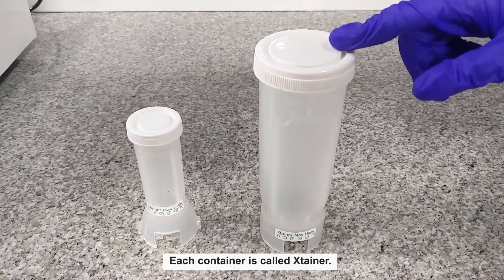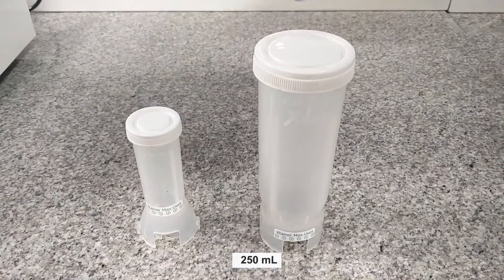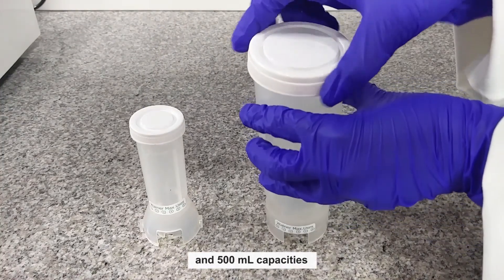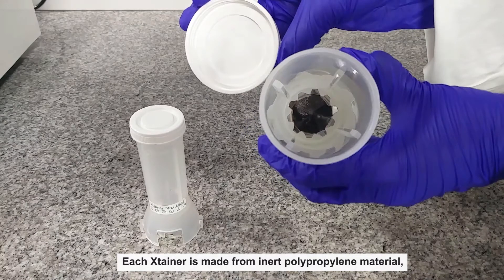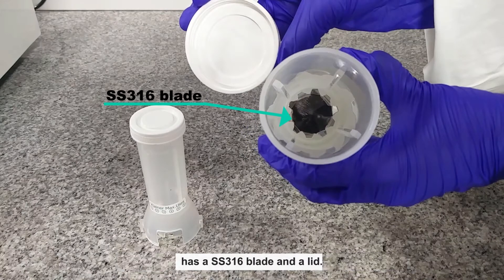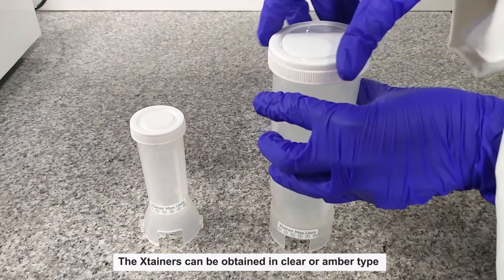The container is called an Extainer. The Extainers are available in 50 milliliters, 250 milliliters, and 500 milliliters capacities. Each Extainer is made from inert polypropylene material, has a SS316 blade and a lid. The Extainers can be obtained in clear or amber type.